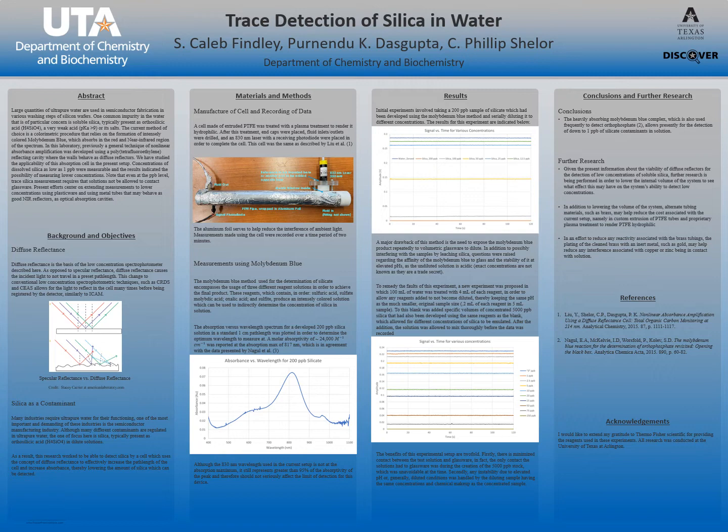Secondly, repeatedly diluting the sample also dilutes our matrix, elevating our pH and changing what the molybdenum blue actually exists in. To remedy the problems posed by this first experiment, we designed a second experiment in which 100 milliliters of water was treated as though it were a sample, with proper proportioning of reagents. To this 112 milliliter sample was added specific quantities of a developed 5,000 ppb sample to represent sort of a stepping up from 0 concentration to 1, 2.5, all the way up to 150 parts per billion.